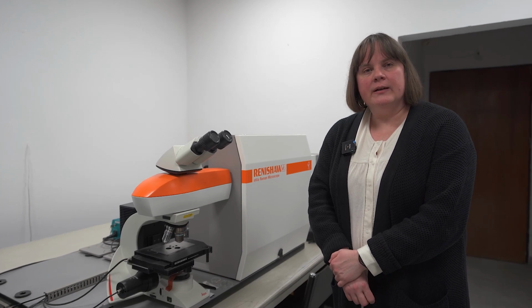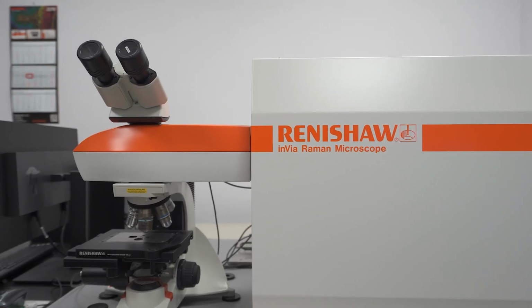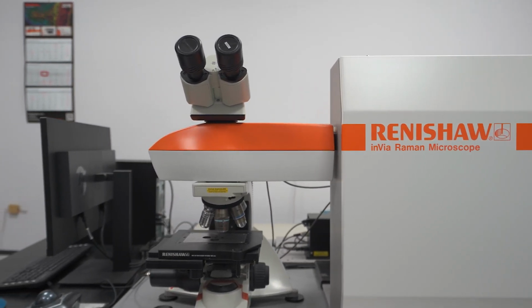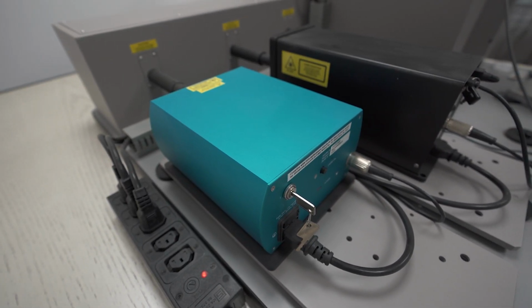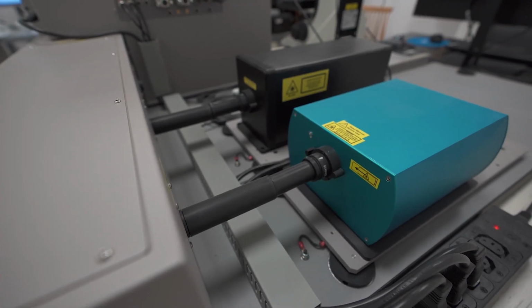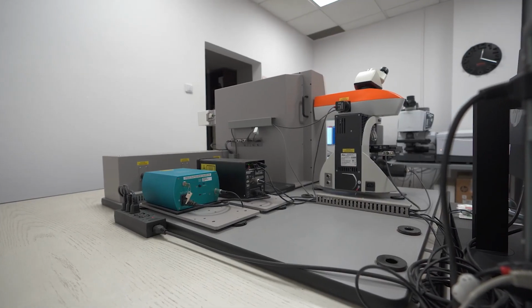The Raman spectra and Raman maps can be recorded in our laboratory also by using the confocal Raman microscope designed by Renishaw. As you can see, the system consists of two lasers with different excitation laser lines, 633 nanometers, the red line, and 532 nanometers, the green line.